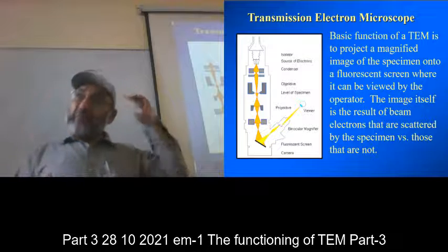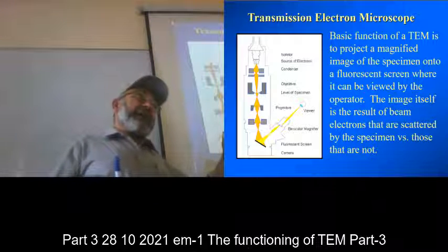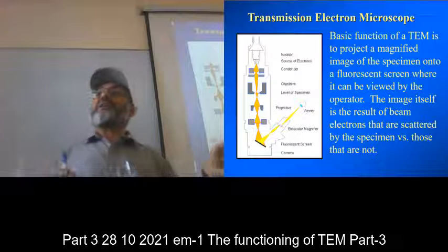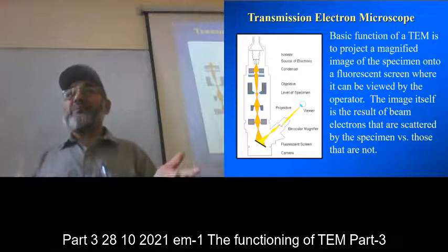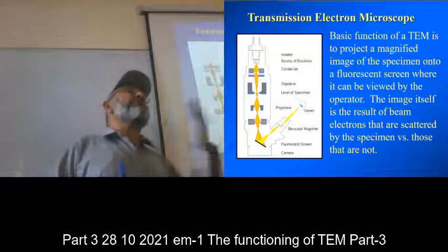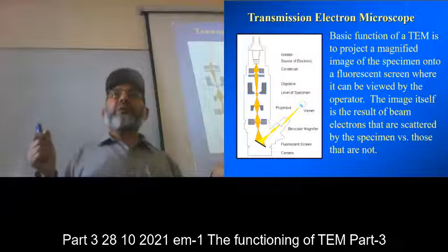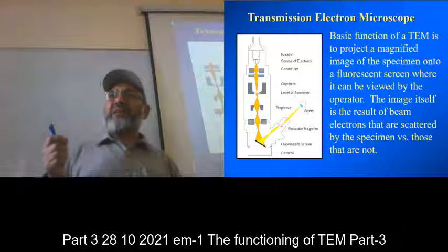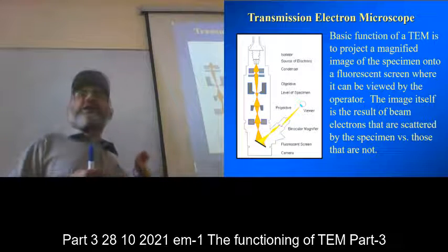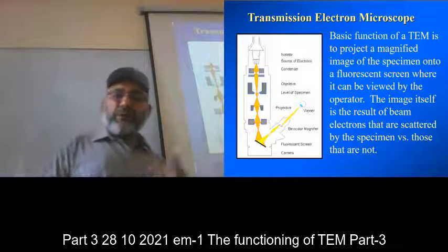So 1 million time magnification was done by the microscope, and then you are looking into the image with another 10 times magnification. So it made 1 million into 10 million. And when you are doing very fine focusing, then people advise to use that central screen, and people do it.